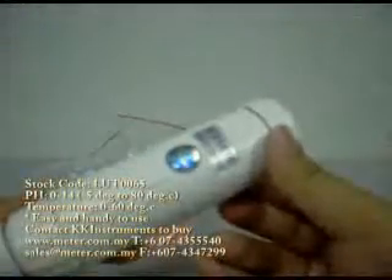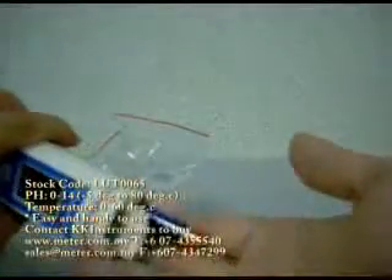This unit is very affordable and comes with a 1-year, 1-to-1 warranty, and this warranty only comes from KK Instrument. The warranty is a manufacturer's warranty and only covers manufacturer's defects. The battery compartment is here, and you use a normal battery that you can get anywhere easily.